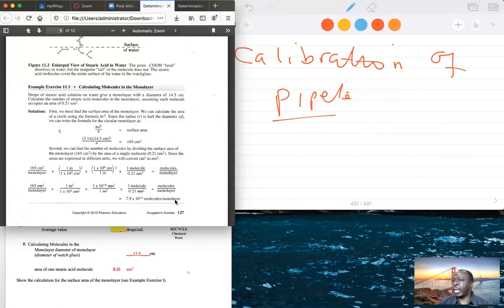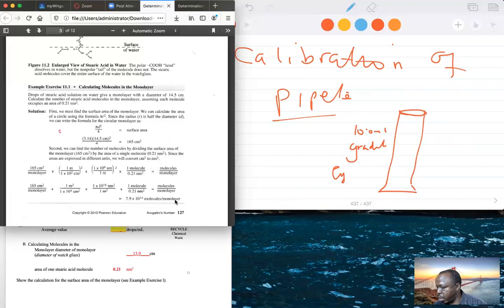In other words, we'll take a graduated cylinder, maybe a 10.0 ml graduated cylinder, and count 1, 2, 3, 4, 5, 6, 7, 8, 9, 10 drops.